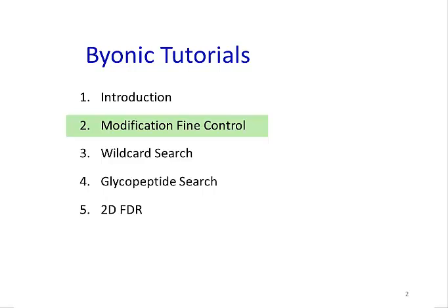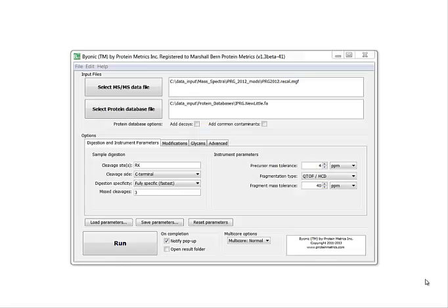You should have already seen the first introductory tutorial. This second tutorial explains one of Byonic's unique features: modification fine control. We will be using as an example a study conducted by the ABRF-IPRG, the Proteomics Informatics Research Group.